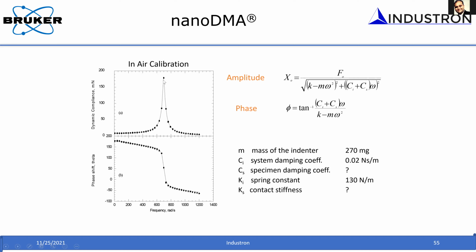We can use that fact, for example, if you want to make ultra sensitive measurements. You can run this experiment closer to the resonant frequency, and then try to come in contact. In such cases, you don't have to apply a very large force. You can apply a very, very small force, but because of the resonance, you have higher sensitivity, and then you can make use of that sensitivity to do very sensitive measurements.